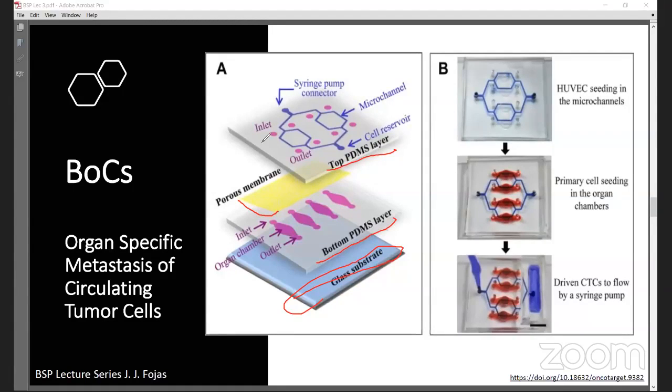So it's quite tricky. The tricky part here is the alignment. So I'm hoping that someone will actually develop a really good and stable microscope with an alignment that would be able to bond the PDMS together. It's because sometimes you can bond PDMS to PDMS without even treatment, without plasma treatment, for example. But in this case, if you have another membrane in between, it is quite hard to bond it without leaking, without treating it. So a good alignment system with probably a plasma inside it could do the trick.